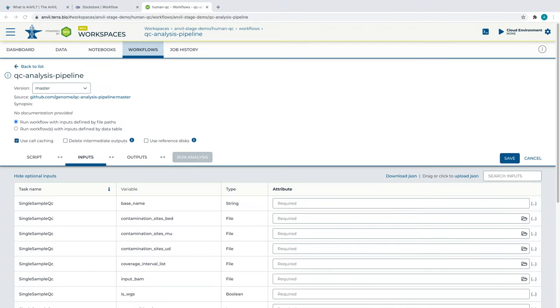Once within the Terra ecosystem, we are already taken to the workflow tab and we can see our workflow as it has been imported from DocStore.